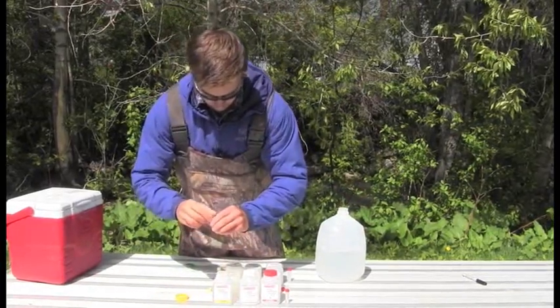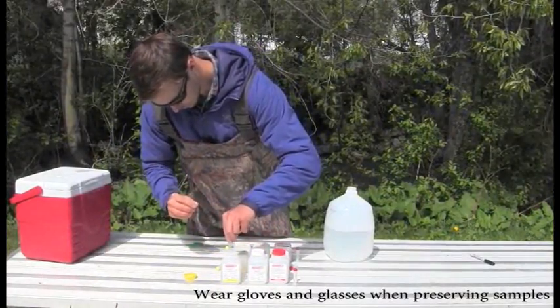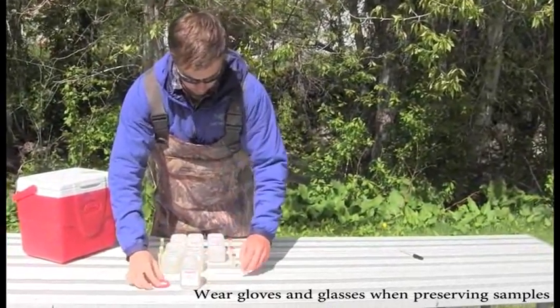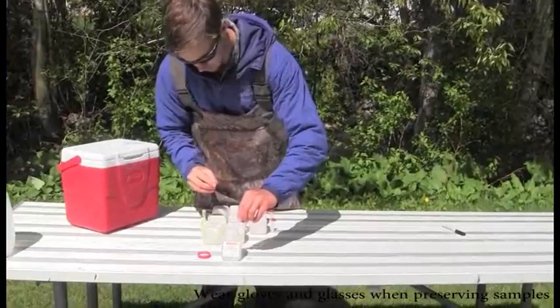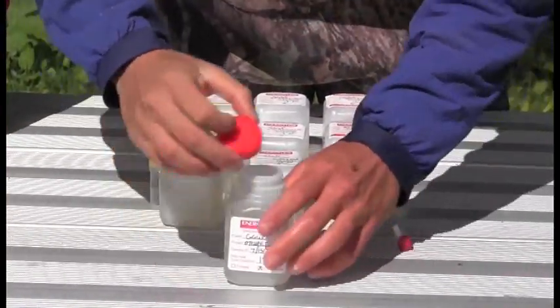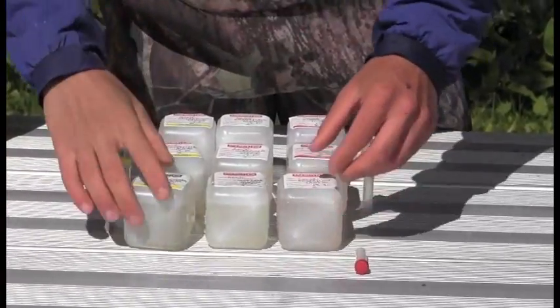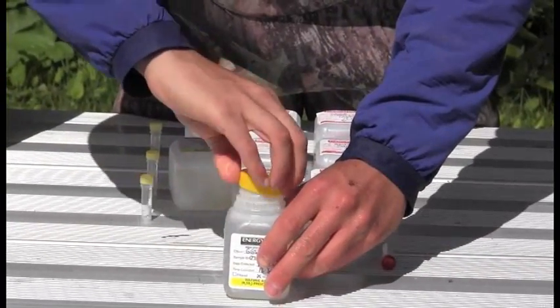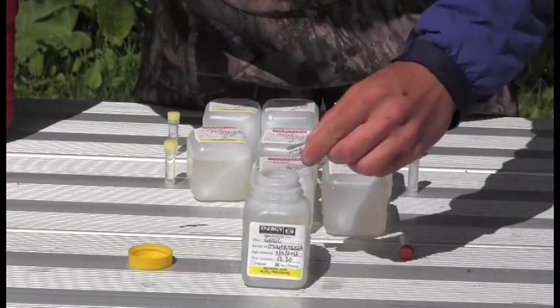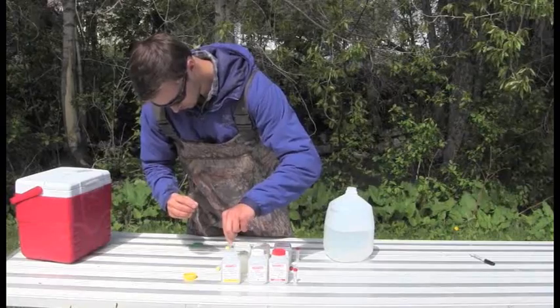After the bottles are filled, add acid to any of the samples that require preservation. Make sure the cap on the acid vial matches the color on your sample bottle to ensure you are using the correct preservative. Carefully uncap the sample bottle and then the acid vial. Pour the acid into the bottle and quickly recap. Then shake or invert several times to adequately mix the preservative and sample water. Repeat the process with the rest of your samples that require preservation. Make sure not to touch the inside of the cap or bottle when adding the acid.